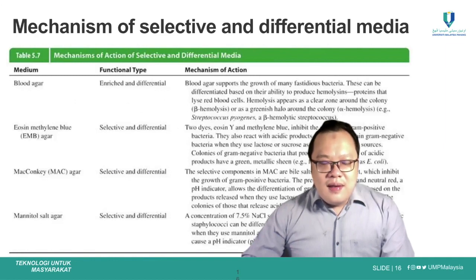Here are some examples of the mechanism of selective and differential media being used in the lab. The blood agar can be enriched and differential because it contains nutrients that are necessary to enhance the growth of the pathogenic bacteria in our blood system.